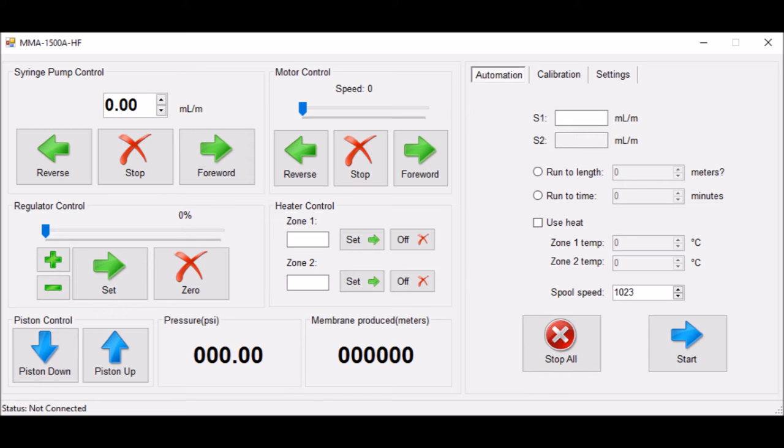On the right-hand side of the window, we can set up an automated operation, controlling aspects such as injection speed, run-to length, run-to time, zone temperature, and spool speed.